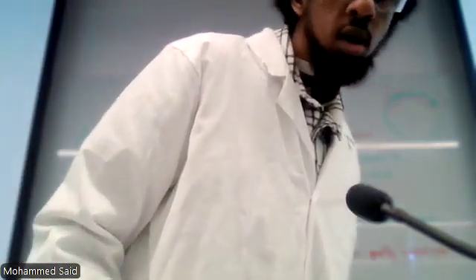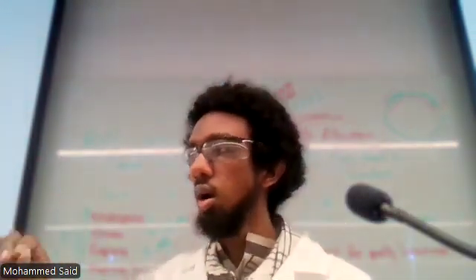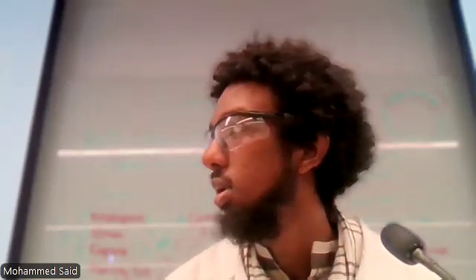In the meantime, focus on the apparatus or the exercises you have to work on today. And then as groups, or actually as individuals, one of you can start counting the colonies when there's enough time. Because there are about 3 plates each group, each of you could at least do one for counting. And then we'll talk briefly about how you would multiply to get your CFUs, colony forming units. Any questions in the meantime? Or to get your original density is what it is normally called.